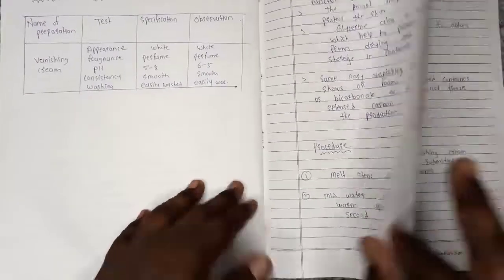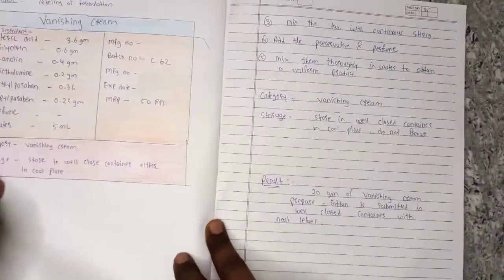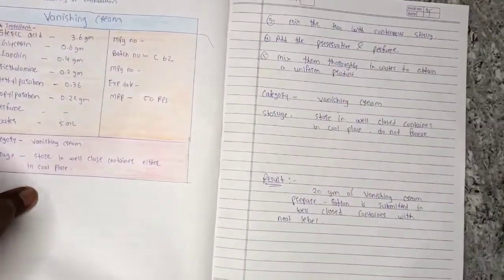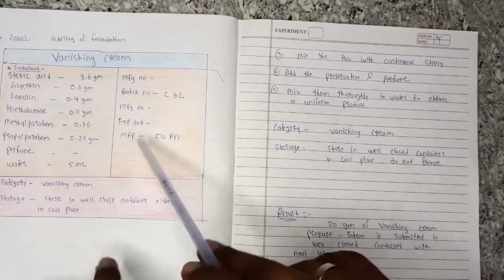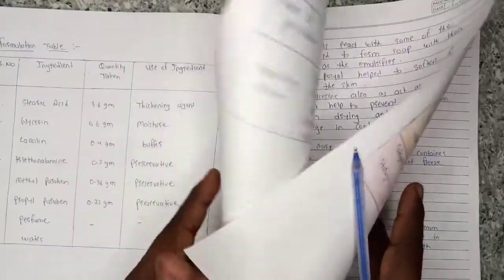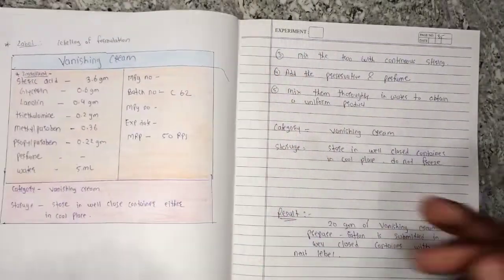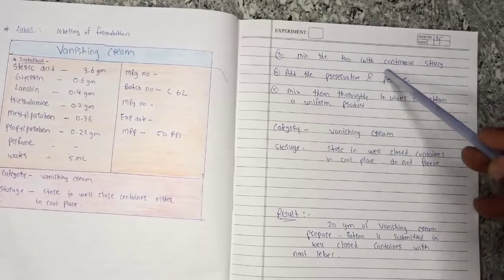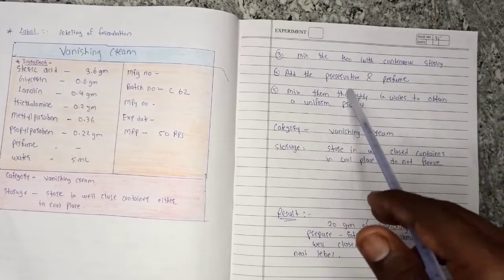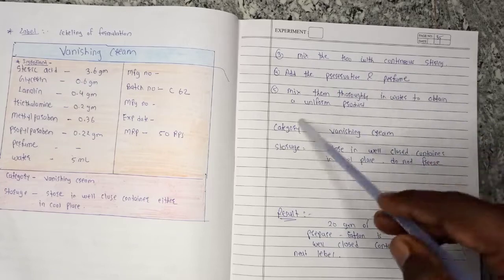After heating, you will need to mix both beakers with continuous stirring. Then add the preservatives, which we have seen in the formula table. Add them slowly and stir. After that, add perfume and mix through water to obtain a uniform product.